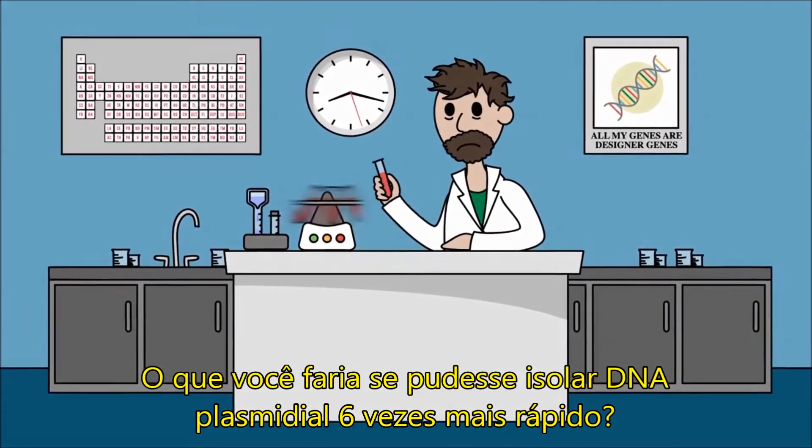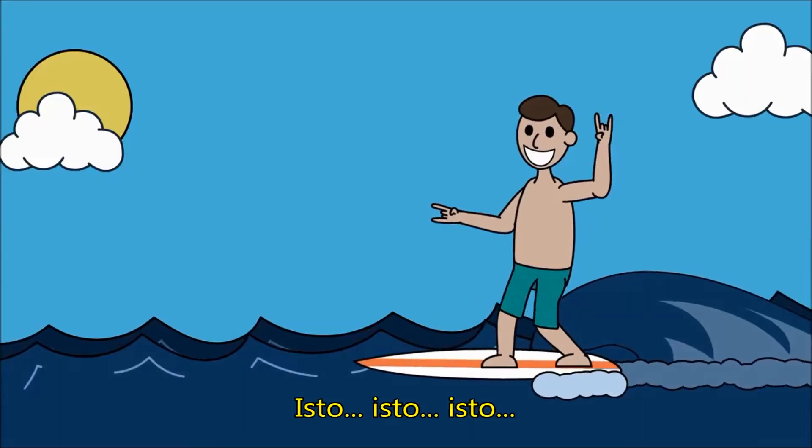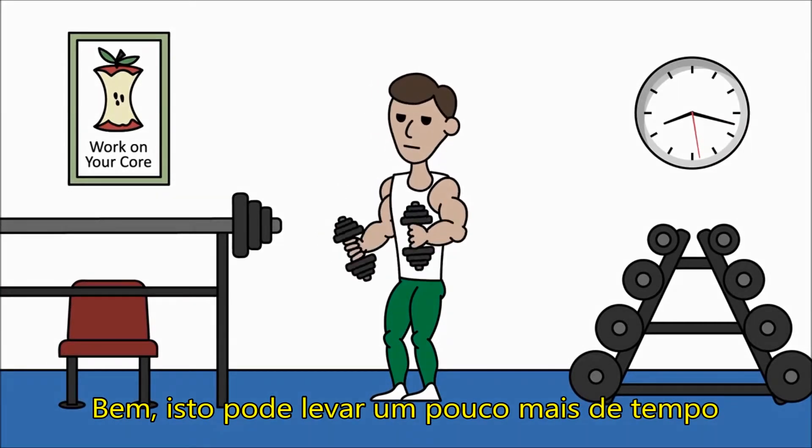So, what would you do if you could isolate plasmid DNA six times faster? This? This? This? You know, that might take a little more time, but check this out.